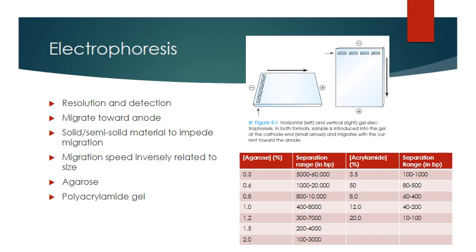And so I give you this chart here, which shows you what concentration of agarose you would use to separate certain sequences of DNA. If they're very small, you can use a higher concentration of say a polyacrylamide gel, or a higher concentration of agarose. If it's very large, you would use a lower concentration. Okay.